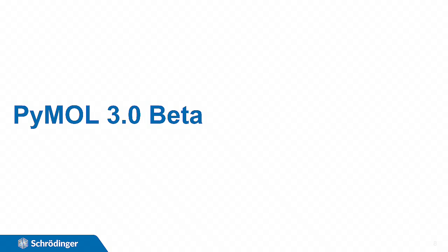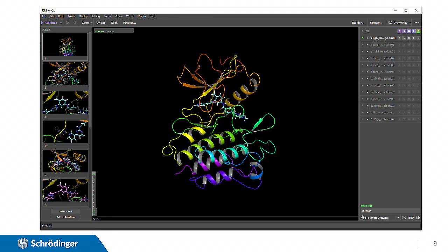So that brings us back to where we are today. One of the main goals in improving PyMOL was to lean in on its strengths of creating stunning molecular images and animations, but also to improve the user experience when it comes to doing so. So, with that, let's take a look at a work in progress, which is PyMOL 3.0 beta. Here we see a modern, sleek, and minimalist interface. It strikes a balance between being fresh and innovative with a sense of familiarity and nostalgia. Anyone who knows PyMOL should recognize the resemblance immediately.